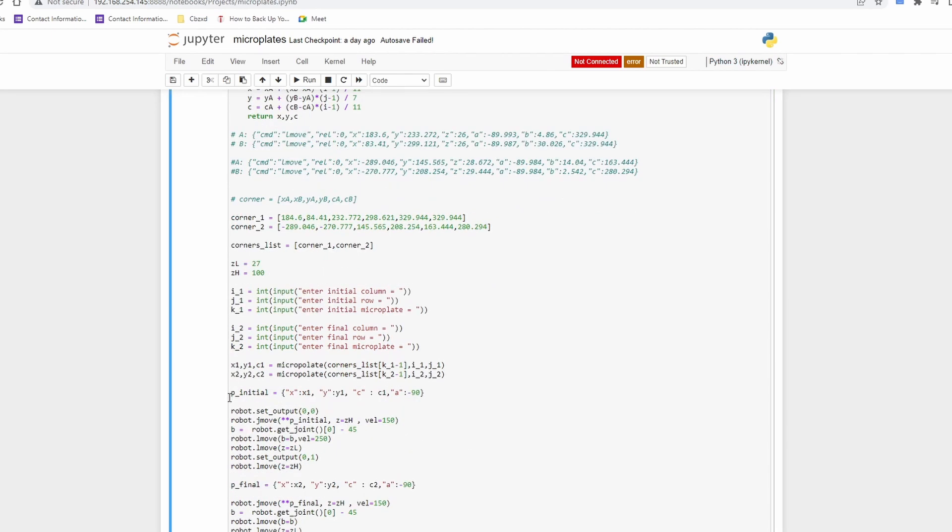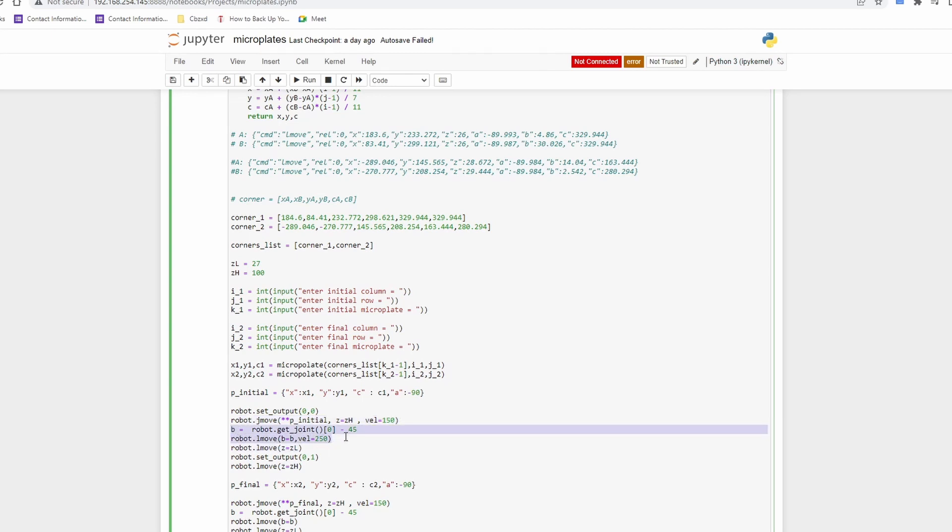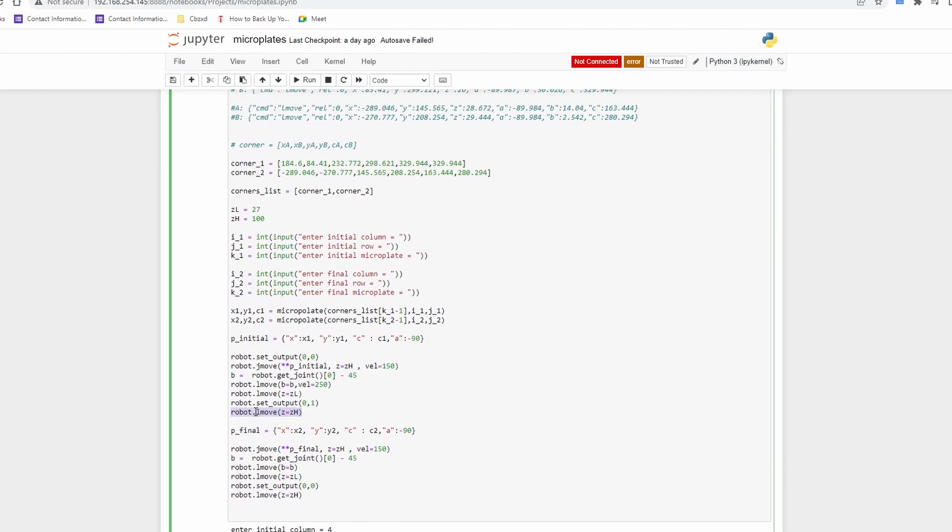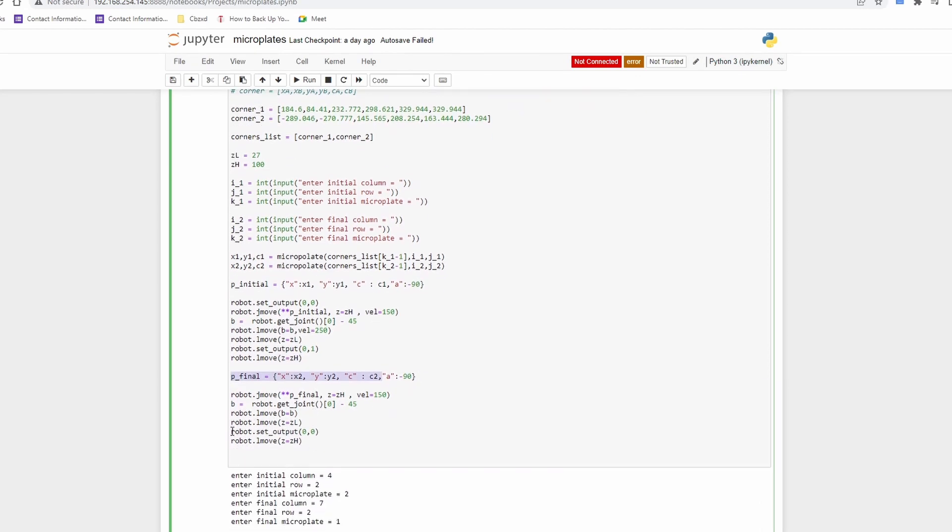Then we design a sequence of moves as follows. First we open the gripper. Then we move to a safe height above the initial point. Then we adjust the orientation of the gripper so the fingertips are aligned with the spaces between microtubes. Next we move down, close the gripper and move up again. We go to the final point and repeat the same sequence but only open the gripper when we place the microtube to the desired location.